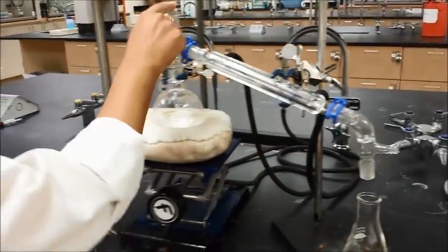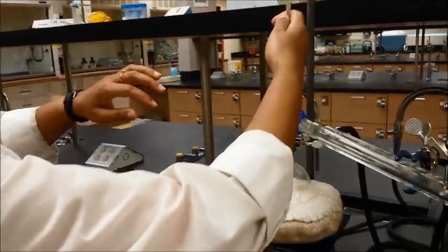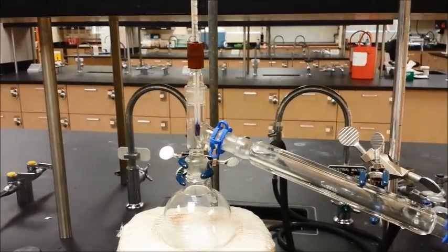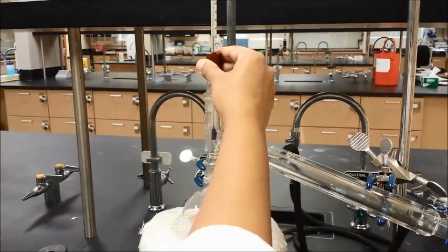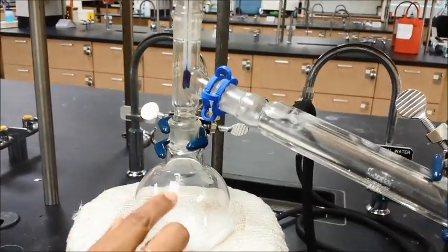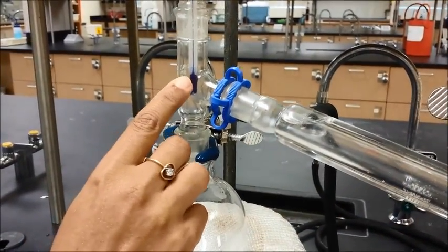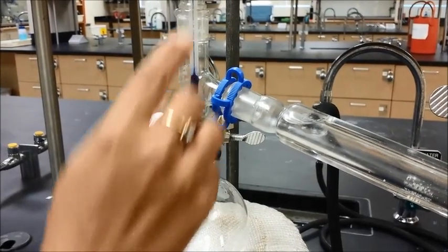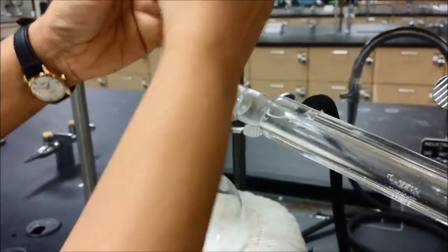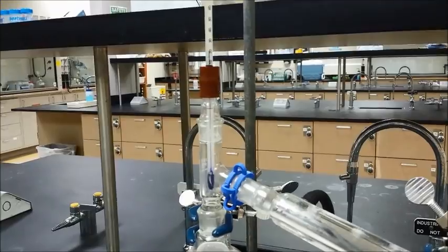The last thing to do is put the thermometer in. The thermometer bulb should be positioned right at the side arm opening, because this is where the vapors are going to come out and start condensing. These are the purest form of vapor and that's the temperature you want for the boiling point and distillation. Face the thermometer toward yourself so you can actually see what's going on.